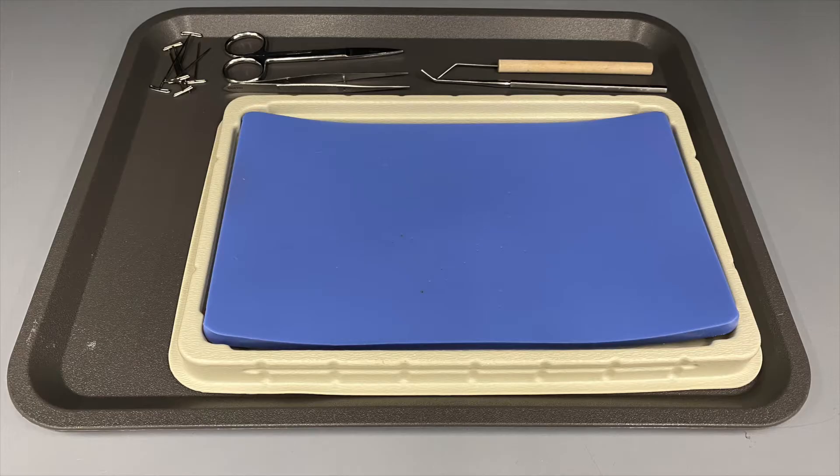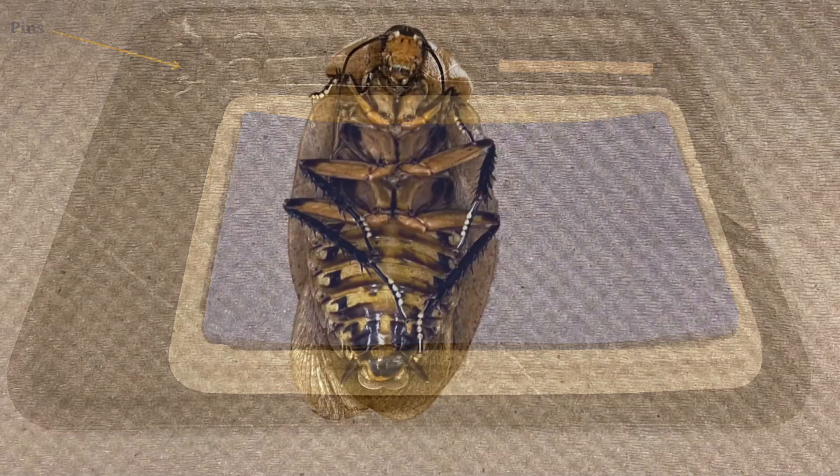Before you begin, make sure that you have gathered all of the necessary equipment. This includes your dissection tray and blue pad, a pair of scissors, forceps, a probe, pins, and of course, a cockroach.